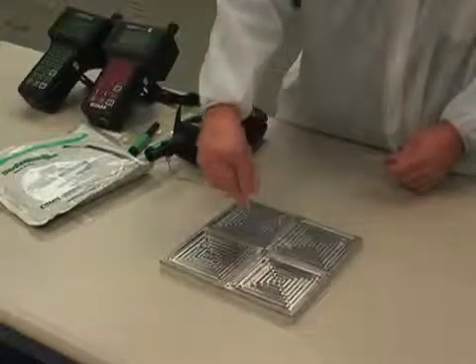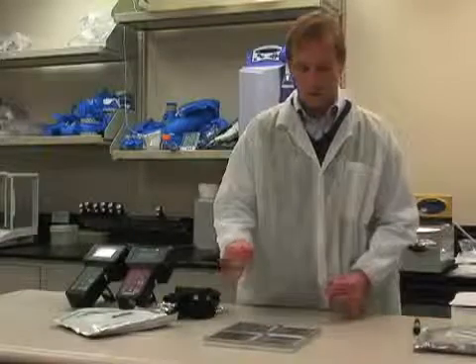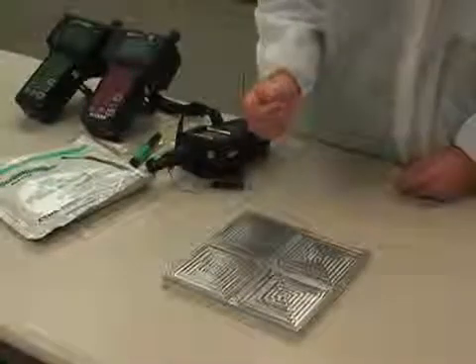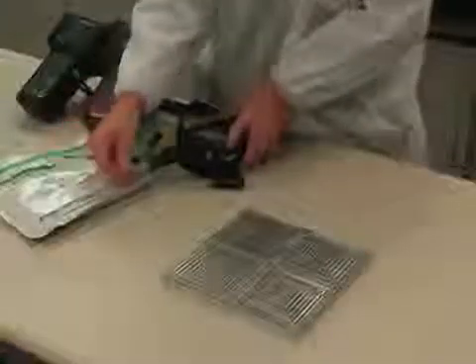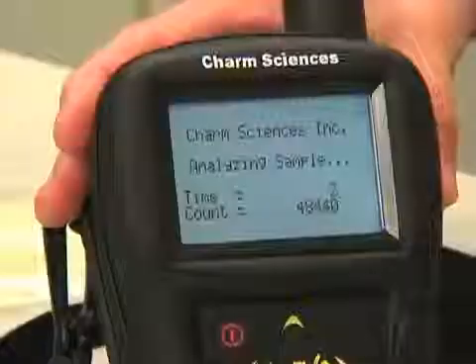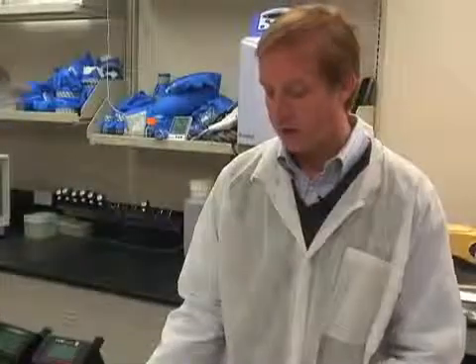By doing a side-by-side evaluation that's not controlled like this, where we're swabbing different areas in a facility, the results are going to vary more. But this still should give you a good idea. Activate the device, shake, shut the cap, press OK, take your reading and then record your results. When doing an evaluation like this, it's important to really look at whether or not the test failed or passed.